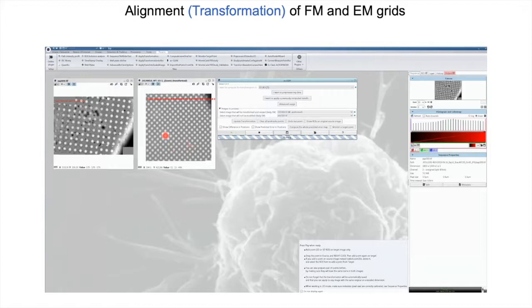So you have EasyClem, this plugin. If you just open the plugin, at least you will go through how this scales in the pixel density. So it does a nonlinear transformation. So at the end of the day, right?